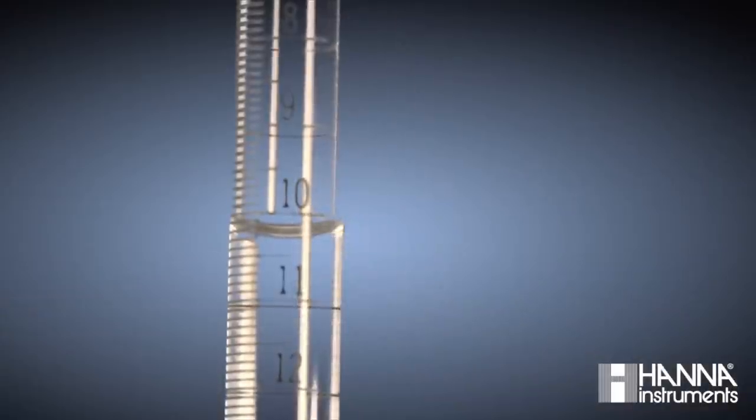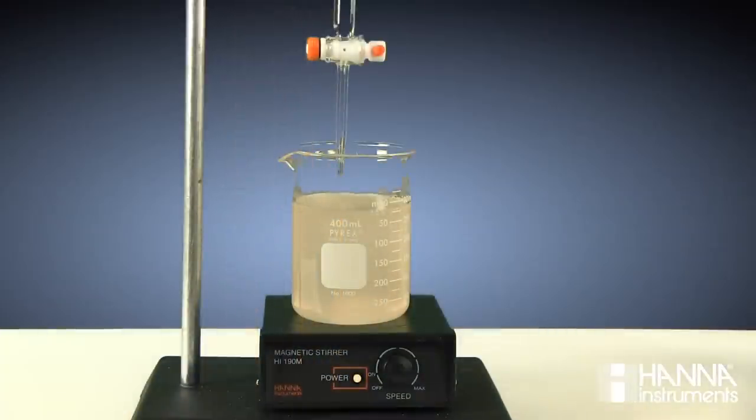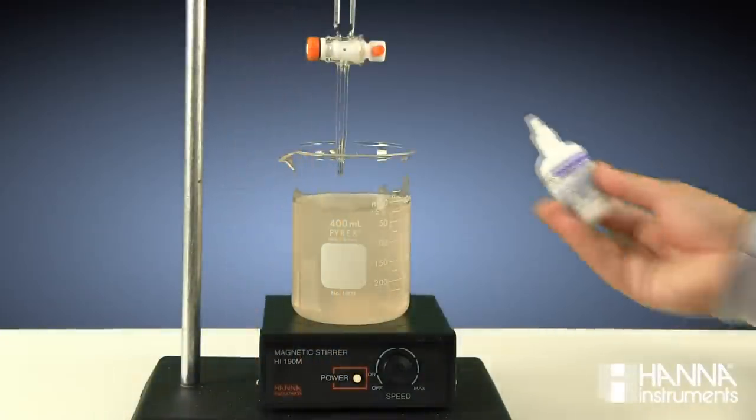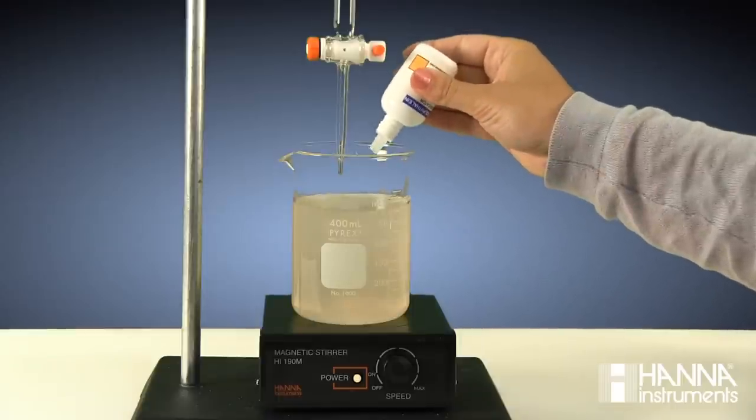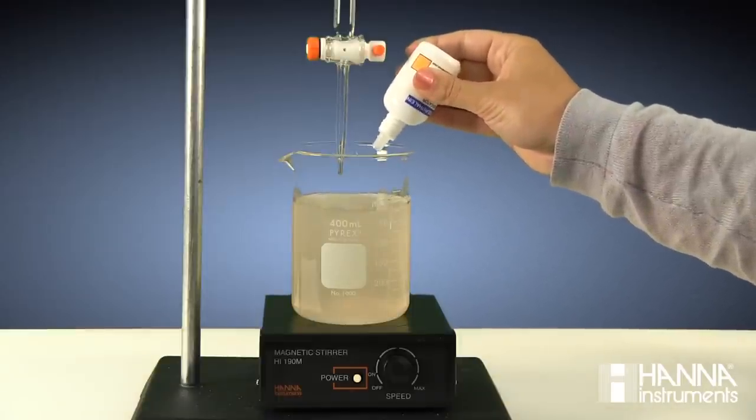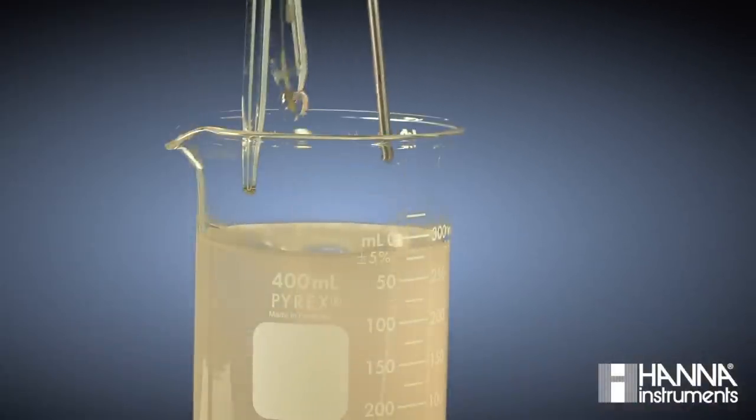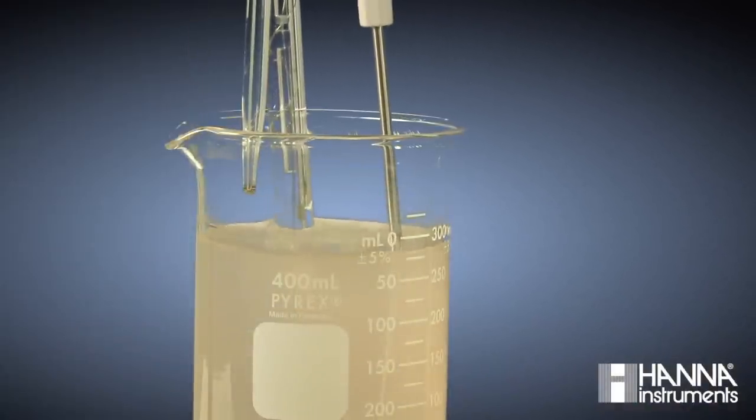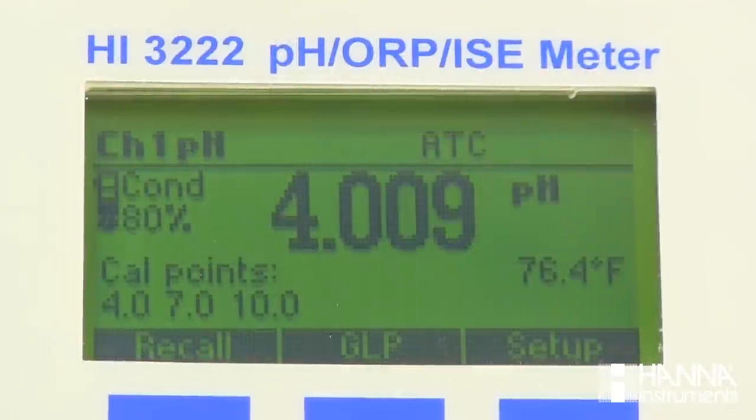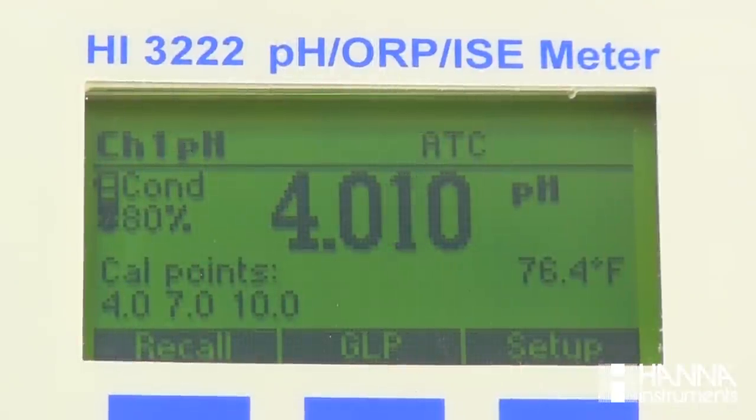Reading our meniscus, we record that our starting volume for titrant is 11.62 milliliters. Once we have our sample stirring, we add four drops of our color indicator phenolphthalein. We immerse our temperature probe and our pH electrode in the solution, making sure the reference junction is submerged. We observe that our starting pH is just above 4.